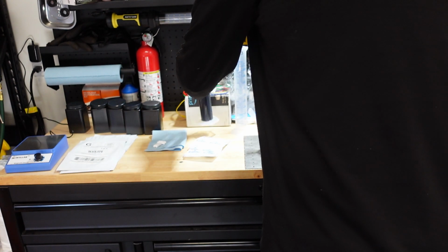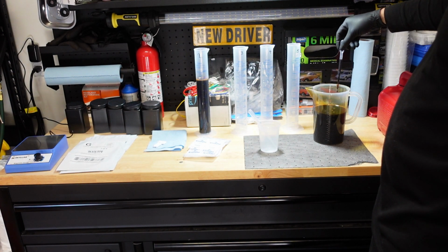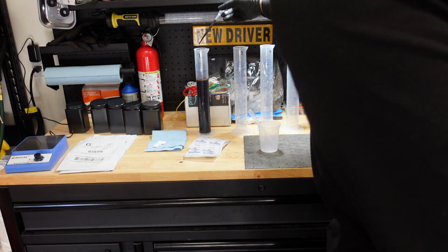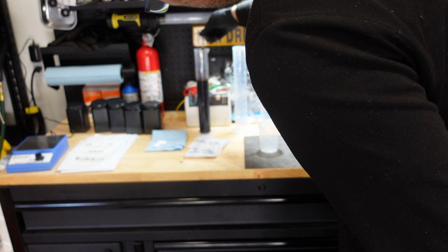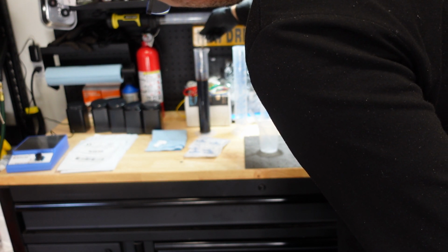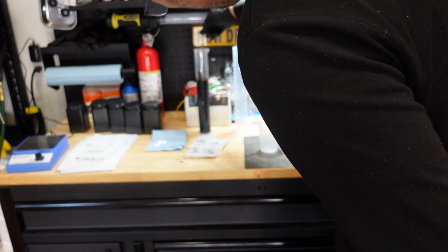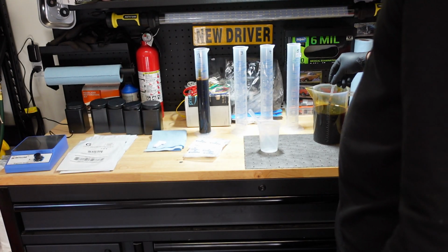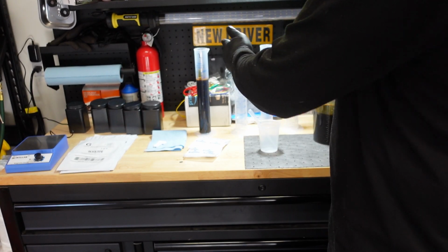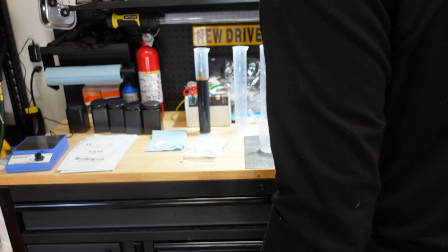So now I'm gonna take my transfer pipette and transfer some over so I can get it as close as it can be to 220 mLs. And again, you may start to see why I'm doing dilution or linearity now, because if there are any errors in the system, it's easier to correct for them, because each sample is relative to the next sample.